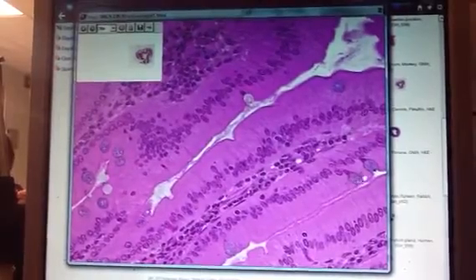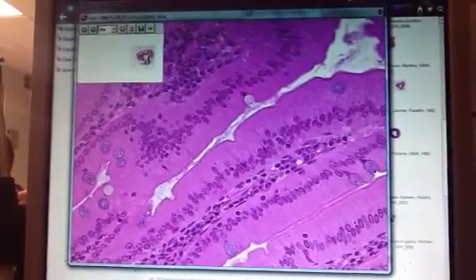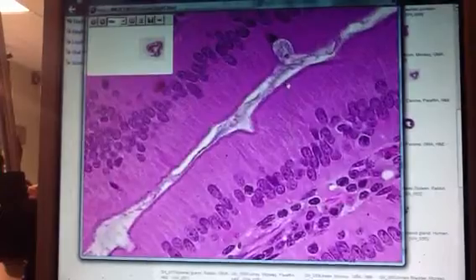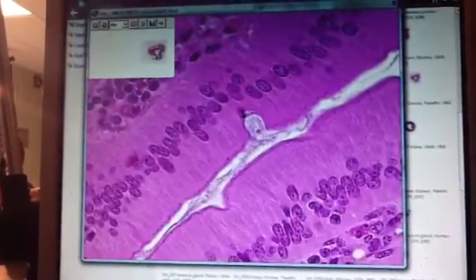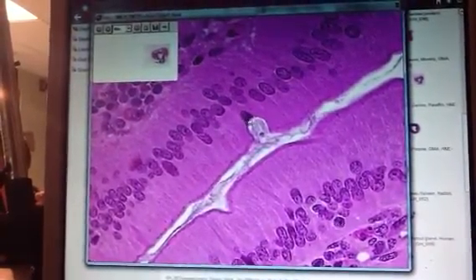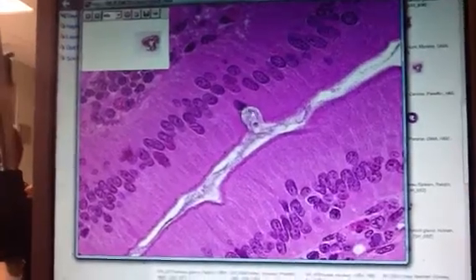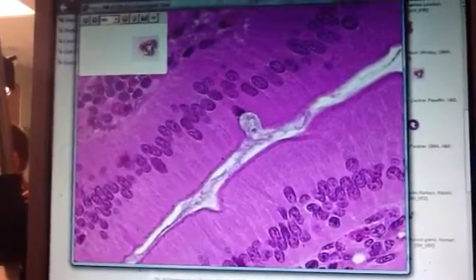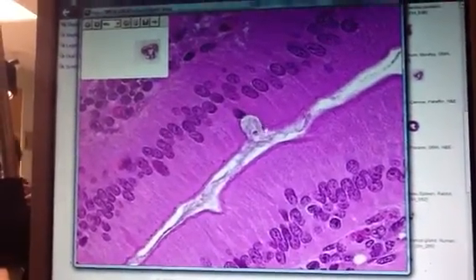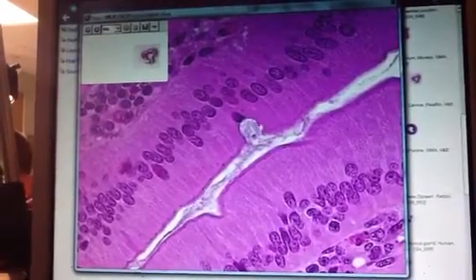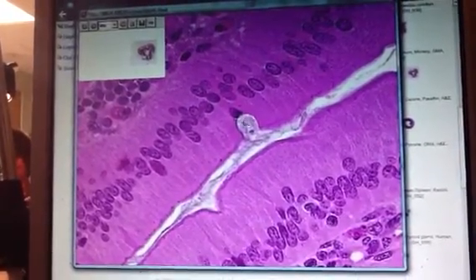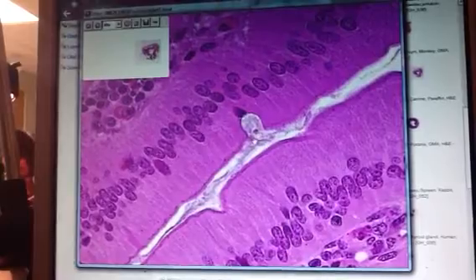These over here are goblet cells. Remember, we said it looks kind of like a wine goblet. Here would be the base or stem of the glass, and here is the actual cup portion of that goblet. This is one cell — it is a mucus-secreting cell that's going to secrete mucus out into the GI tract.